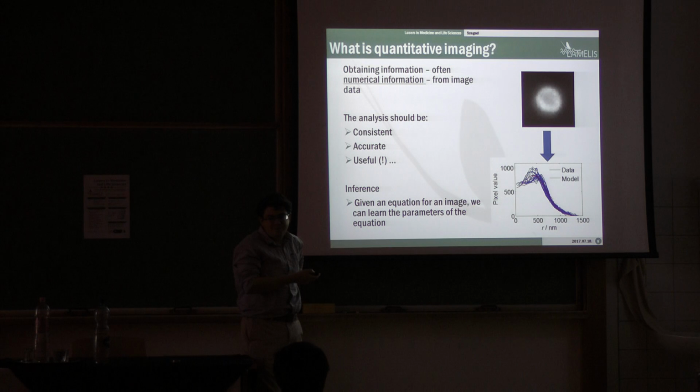But it would be much better if we had not a visual assessment, but a mathematical assessment, taking the image data and doing some consistent calculations on it to get more precise information. In particular, I'll come back to this graph later in the talk. I'm interested in mathematical techniques which, because they're computational, you know they're consistent. You're applying exactly the same analysis to every image measurement. They can be accurate because the computer has a lot more time on its hands to painstakingly look through thousands of different images, which you could never do visually.